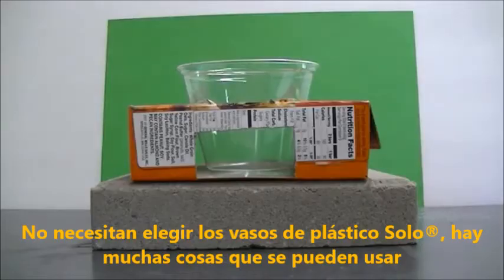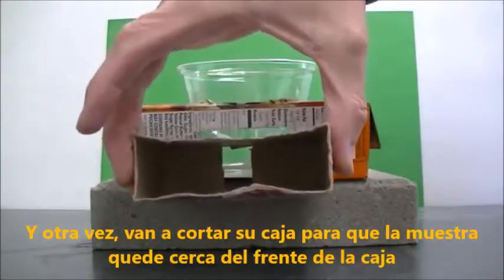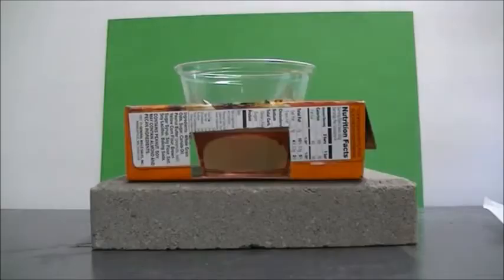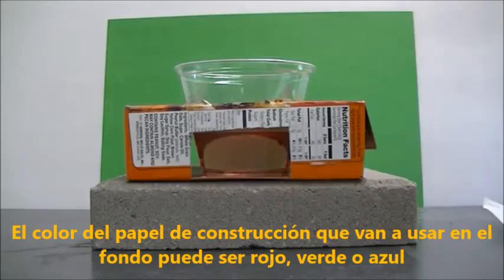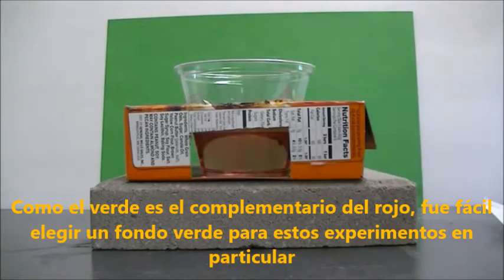You don't need to choose a solo plastic cup — there's all sorts of things you can use. This is an example of a sample box that I cut to hold cuvettes, and you're going to want to cut your box so that the sample rests near the front. The color of construction paper you use in the background should be either red, green, or blue, chosen so that it closely matches the complementary color to the color of your solution. Since green is the complement to red, it was easy to choose a green background for these experiments.